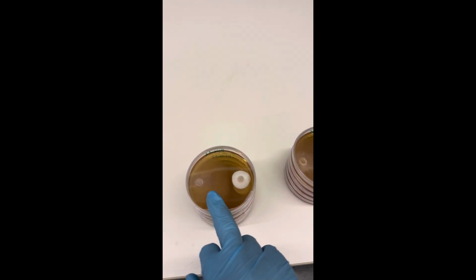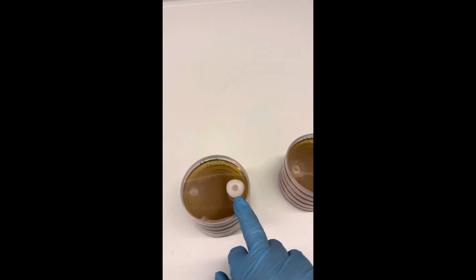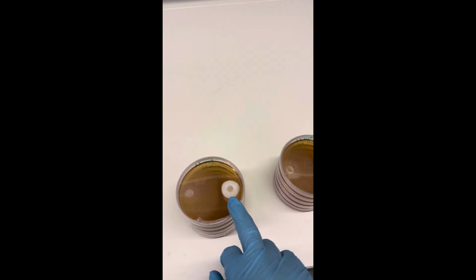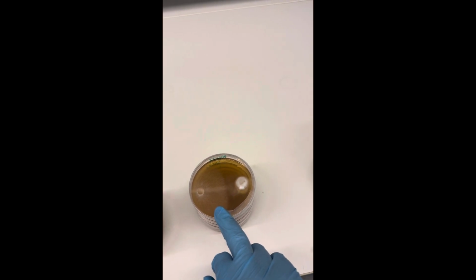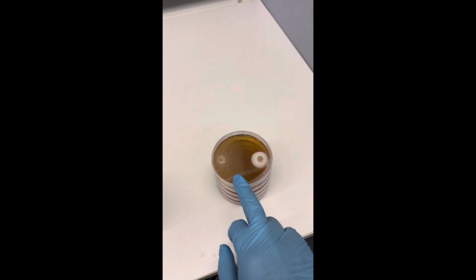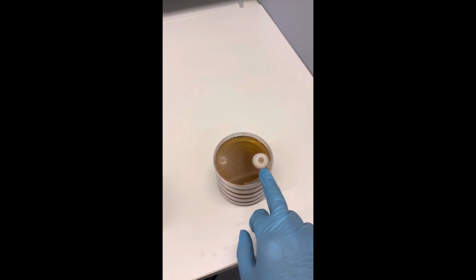On the left side you can see that this species is Heterobasidion annosum, and this one on the right is a species which we collected from a forest close to the capital of Finland. Similarly, on the left side Heterobasidion annosum, and this is an unknown species. This is the same: left side Heterobasidion annosum and right side an unknown species.